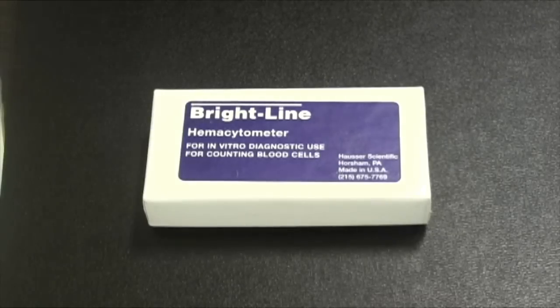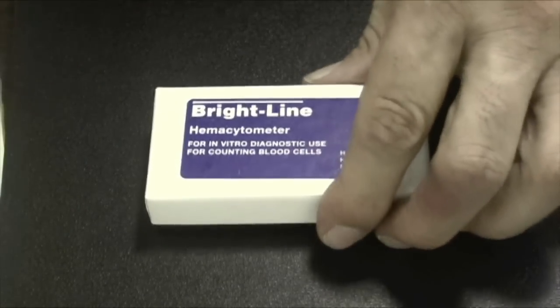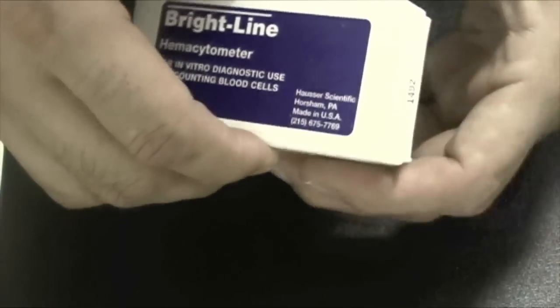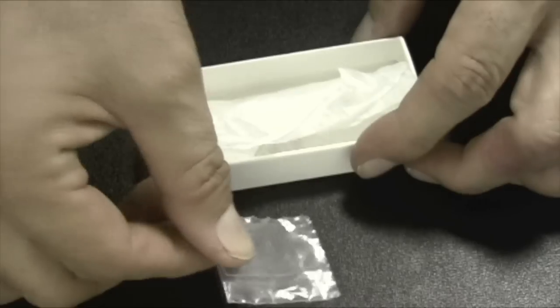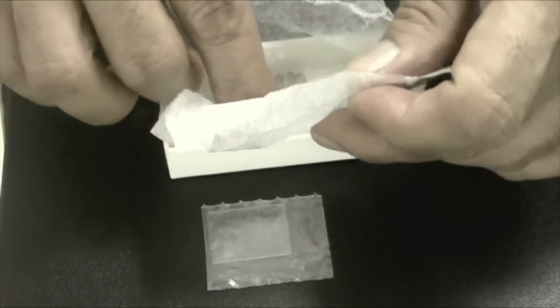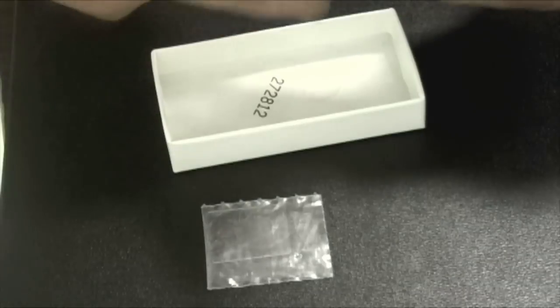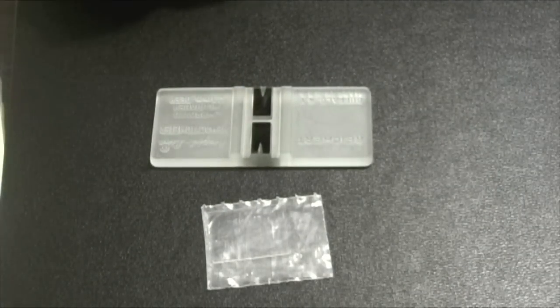We always want to keep our hemocytometer in its box. These will last for a very long time if we take care of them, and they are fairly expensive. So let's quickly remove it. The first thing you'll see is a small cover slip. These are special heavy-duty cover slips, and we keep them in a little plastic bag. The hemocytometer should be cleaned before it's put away, and we usually wrap it in a piece of lens paper to keep it clean. That's basically what the device looks like.